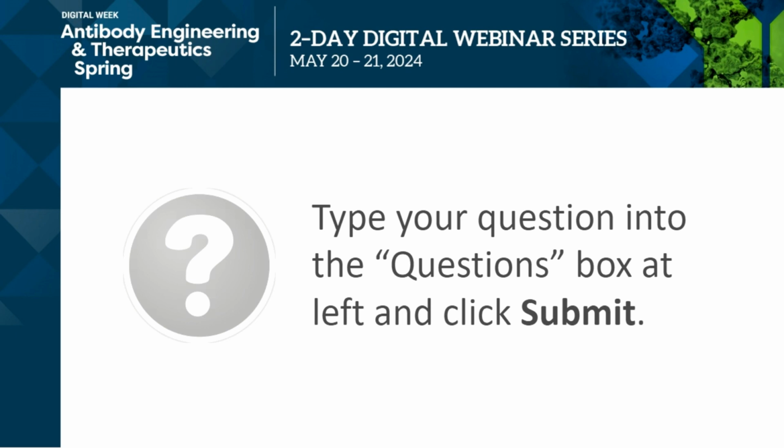Because if we know the formula for K-on, it needs concentration. But for this particular case, these are direct periplasmic solutions. So we cannot obtain that concentration. So the other parameter we can do is only K-off in this case. But this is just this particular case. You can do K-on, K-off, or KD also, if you know the concentration.